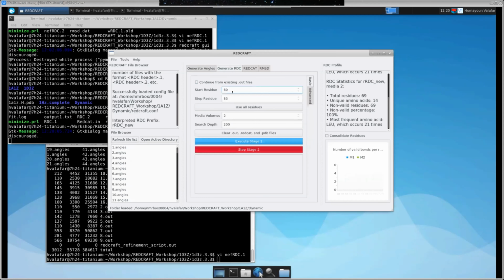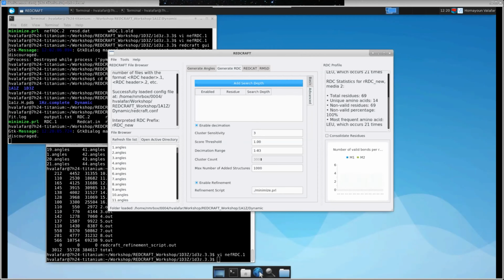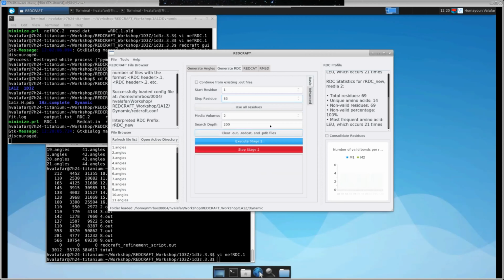Then I showed that if you go to, I'm going to leave everything here as is to demonstrate what happens. Let me further reduce this to 500. And if I go to basic and just run everything as is, with this exact setting, I was able to fold 1A1Z under the conditions of being a static structure. Here, I'm going to run it. This may take a little bit.